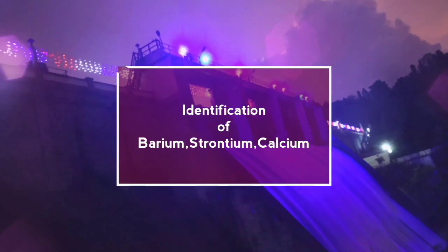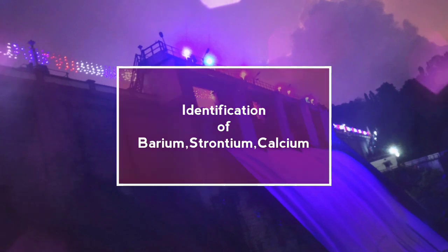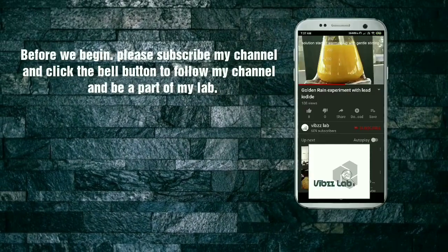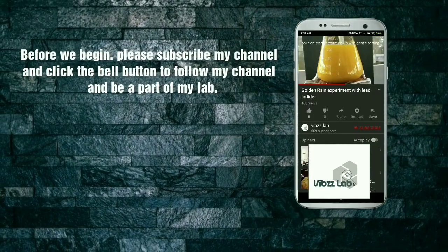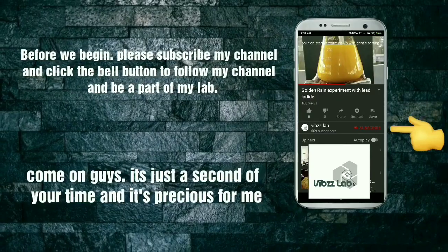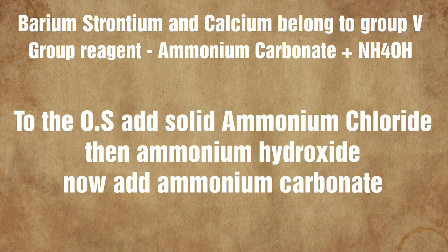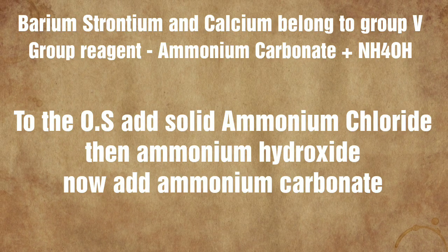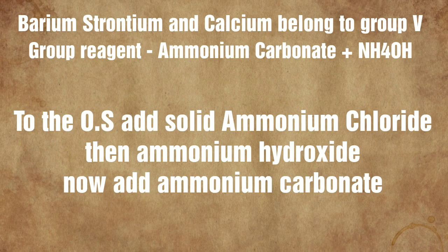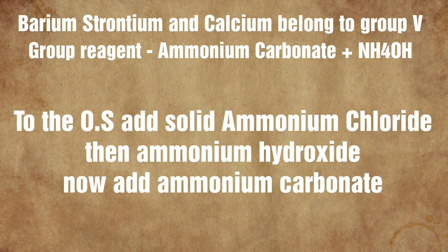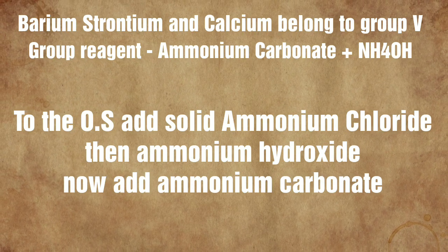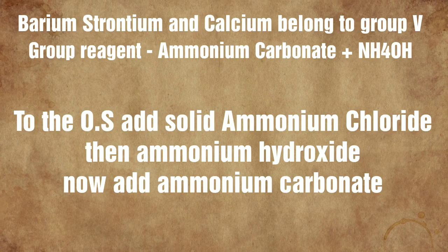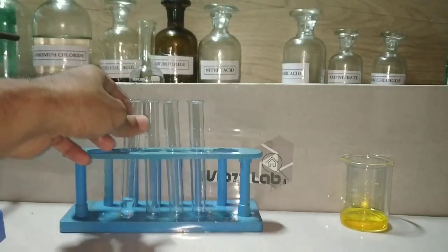Today we will be doing the identification of Group 5 cations. Barium, strontium, and calcium belong to Group 5, and the group reagent is ammonium carbonate with ammonium hydroxide.